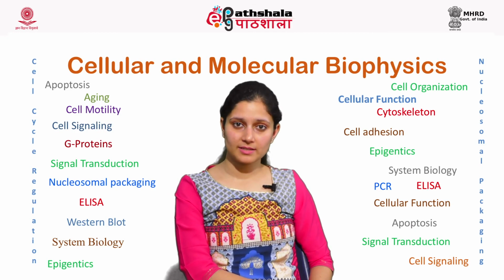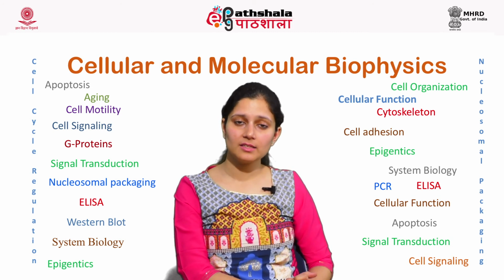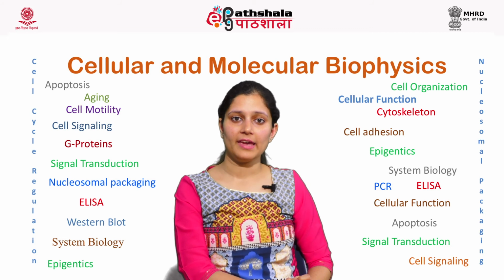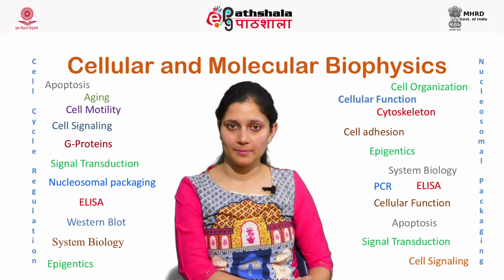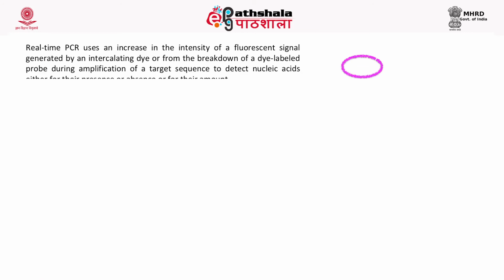There are some important terms in real-time PCR. Knowing the definition and understanding the importance of these terms helps in quantification of real-time PCR and in its measurements. Now, real-time PCR uses an increase in the intensity of a fluorescence signal generated by an intercalating dye or from the breakdown of a dye labeled probe during amplification of a target sequence to detect nucleic acids, either for the presence or absence or for their amount.